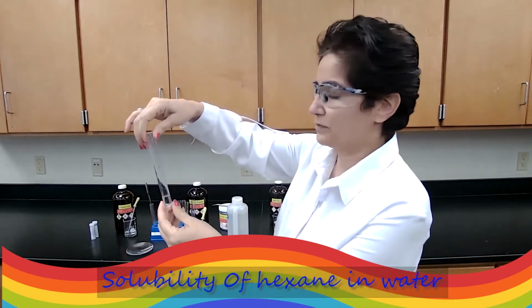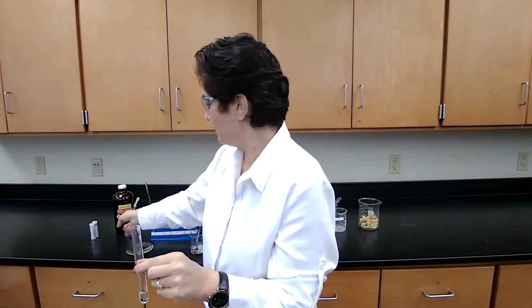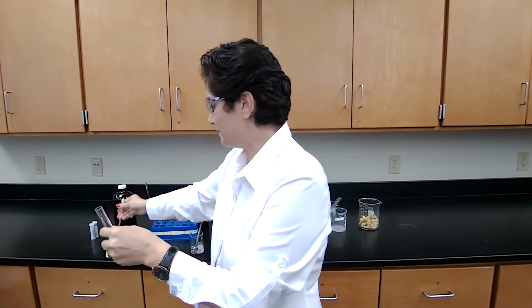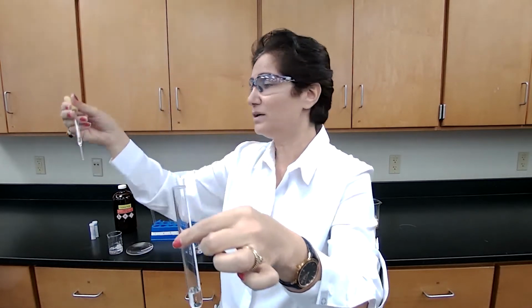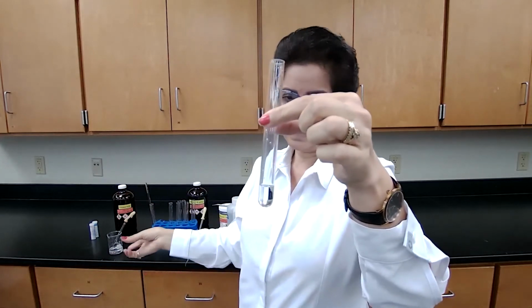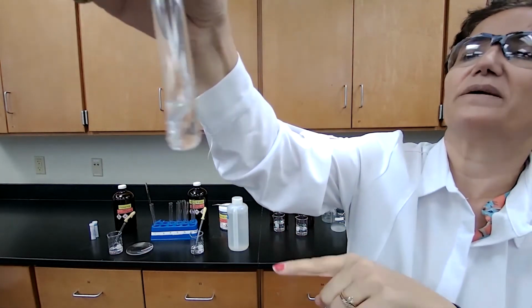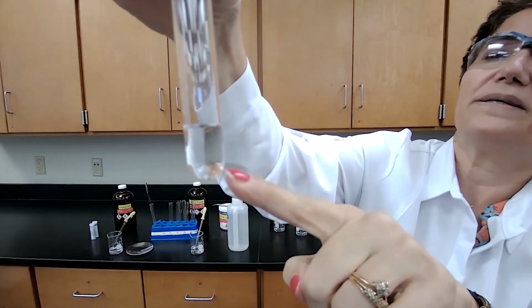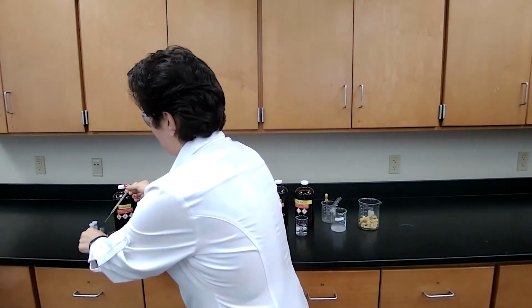To the second test tube that I have, I'm going to add the hexane, which is a non-polar organic molecule. Because these are known samples, we are just going to test with the known sample. We are learning about the technique, how to test for solubility, and we are training our eyes to see how an insoluble compound would appear in the solvent. If I just look at it like this, I may not see that it's not soluble, but when I shake it vigorously, I see droplets of the liquid, like droplets of an oily compound, coming down and going back up. I'm going to add extra drops to thicken that layer.